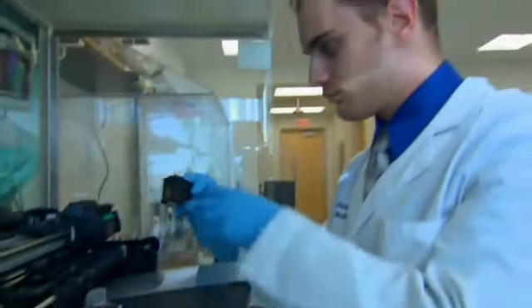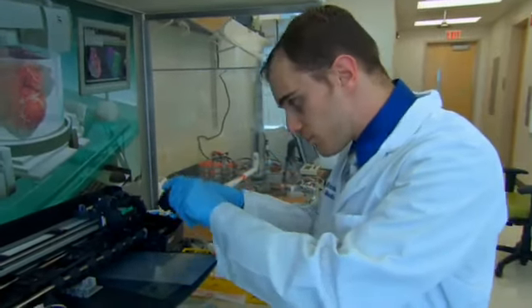And just using the normal method, just printing out a sheet of paper, you can print out a human tissue instead of ink. With this new technology, doctors will be able to print skin cells on soldiers and other people with burns. The Army is interested because burns can account for 10 to 30% of all casualties on the battlefield. The technology that we're developing isn't just going to be for the Army. We're hoping that eventually we'll be able to extend it to firefighters or policemen or other people who put themselves in the line of fire.